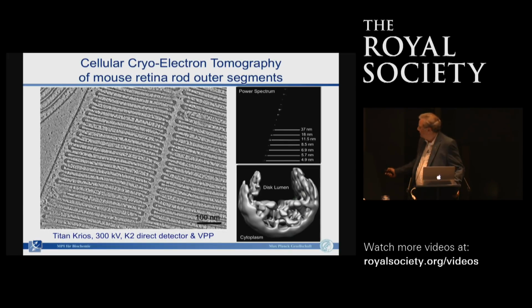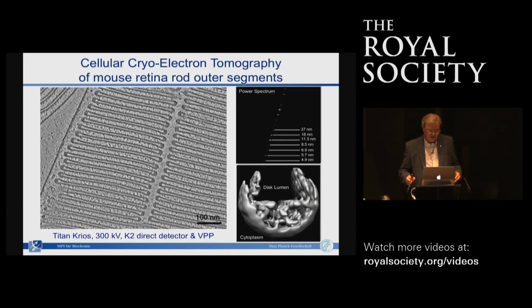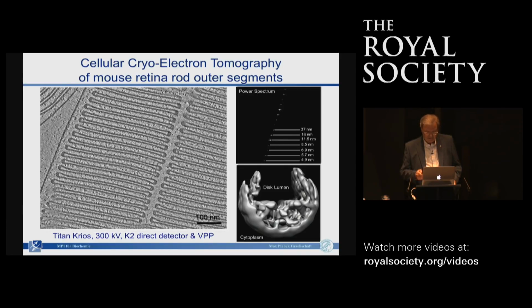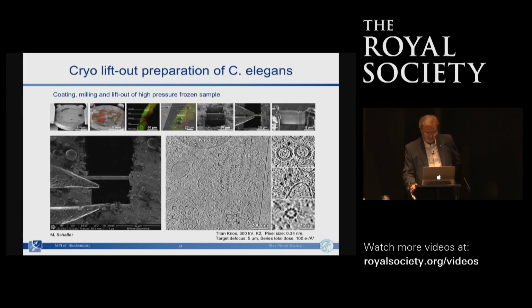We are making progress with this one here because we have now isolated peripherin, now doing a single particle structure which we can dock into the tomogram. But the main challenge is to look for the supramolecular organization of rhodopsin in the membrane, and we are at the very beginning here to interpret the modulations in density in the membrane plane. But I'm pretty confident we have now good structures of rhodopsin dimers and so on that we can, in the end, interpret these tomograms completely.